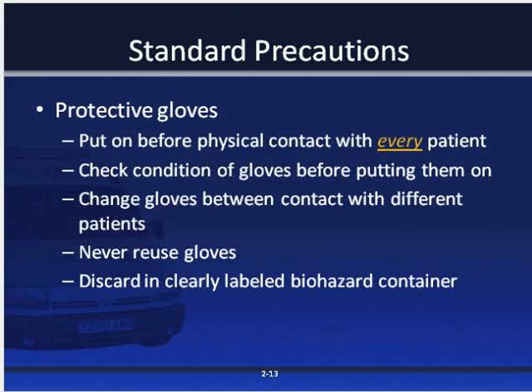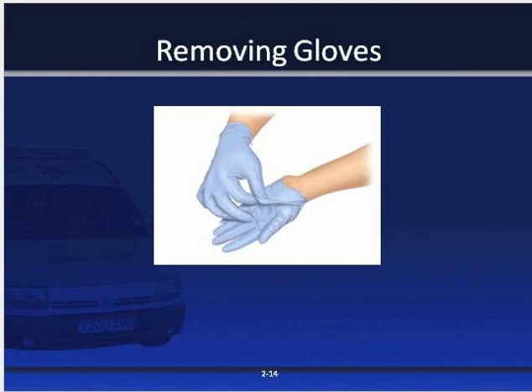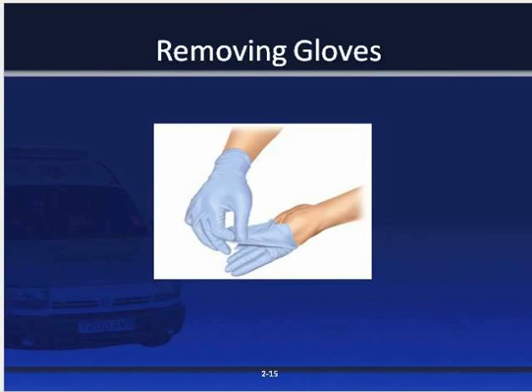Sanitizer containers. This is the proper technique for removing gloves. This is to ensure that you don't get any pathogens on your skin. You can see how you're taking it off with the one glove, and you're balling it up.